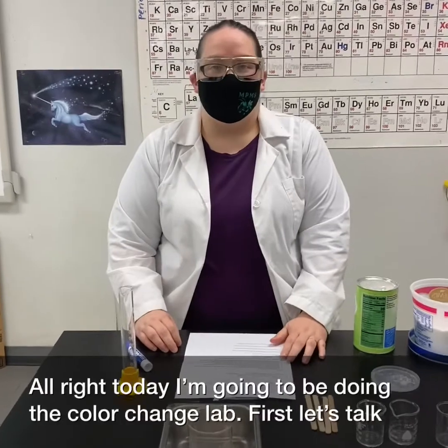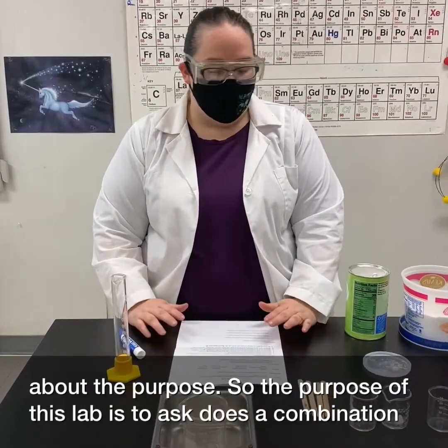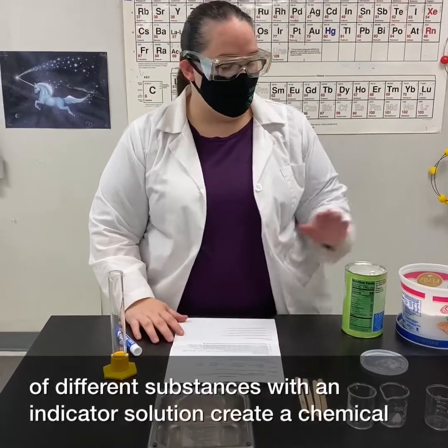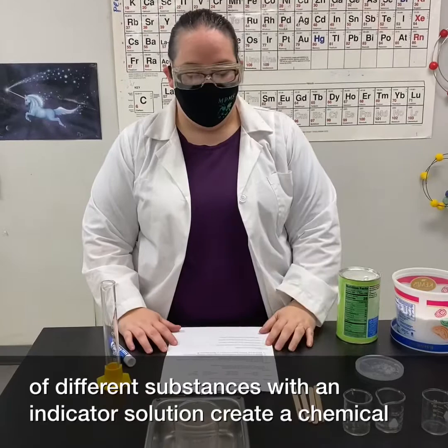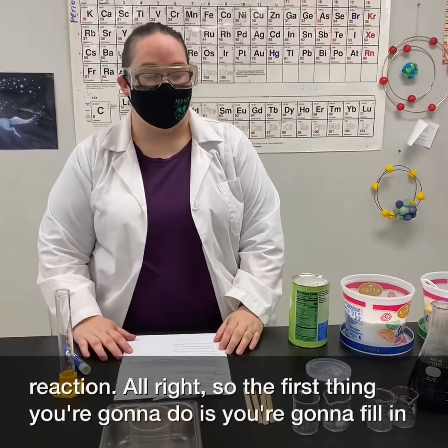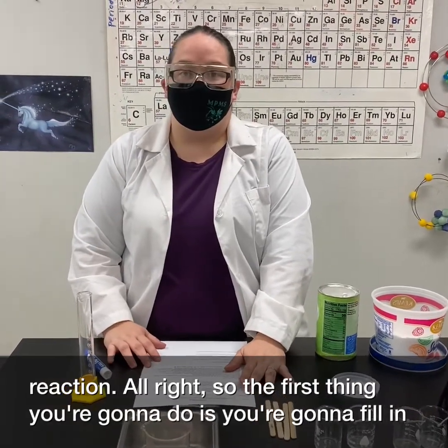All right, today I'm going to be doing the color change lab. First, I'm going to talk about the purpose. The purpose of this lab is to ask, does the combination of different substances with an indicator solution create a chemical reaction?